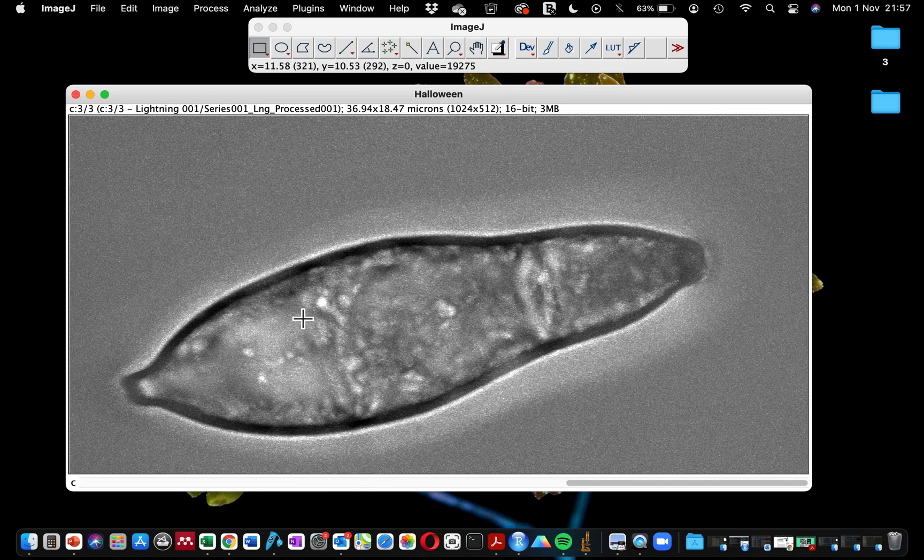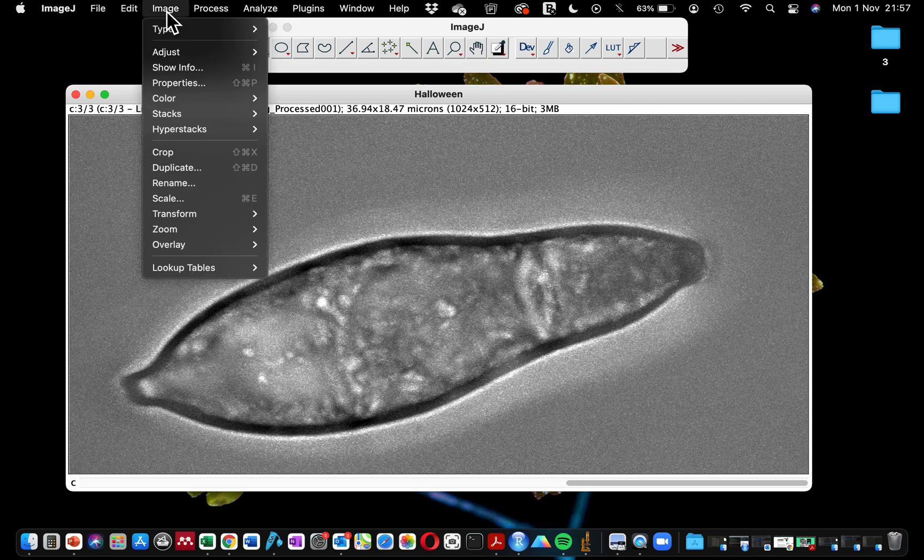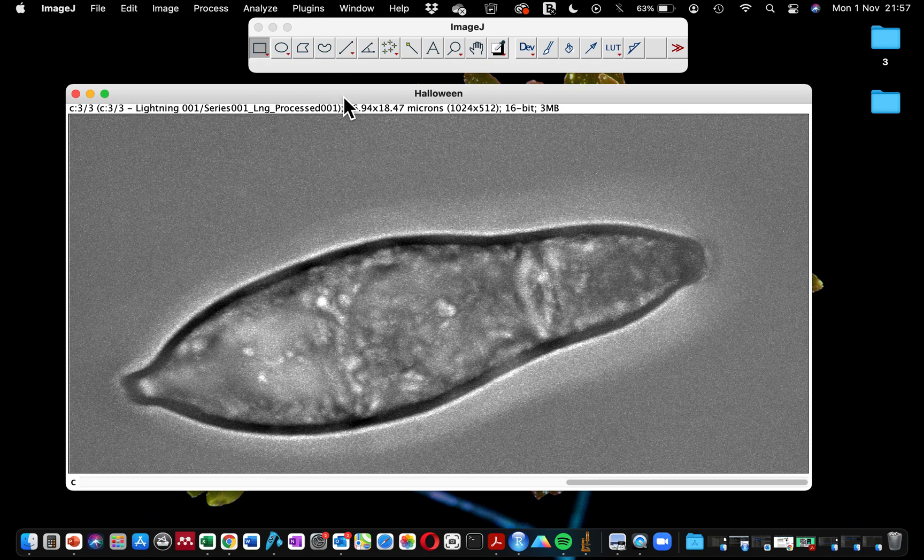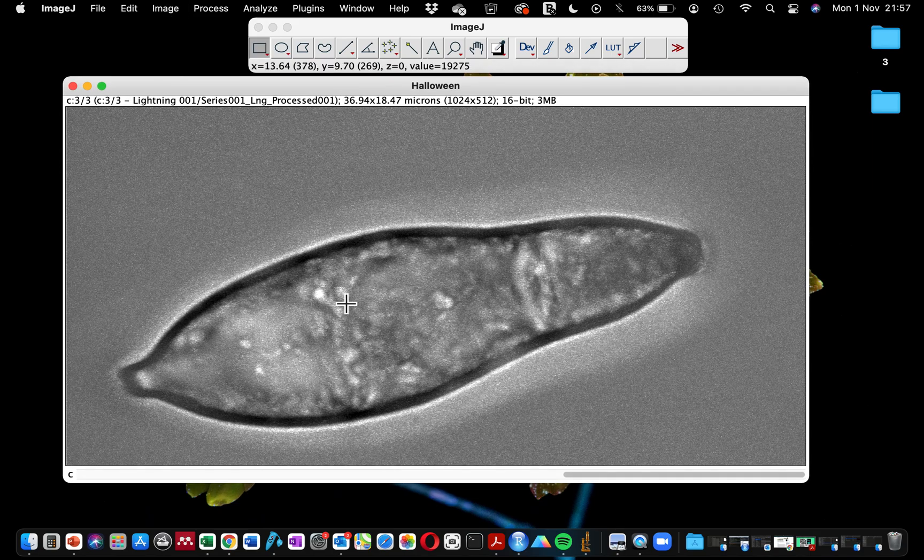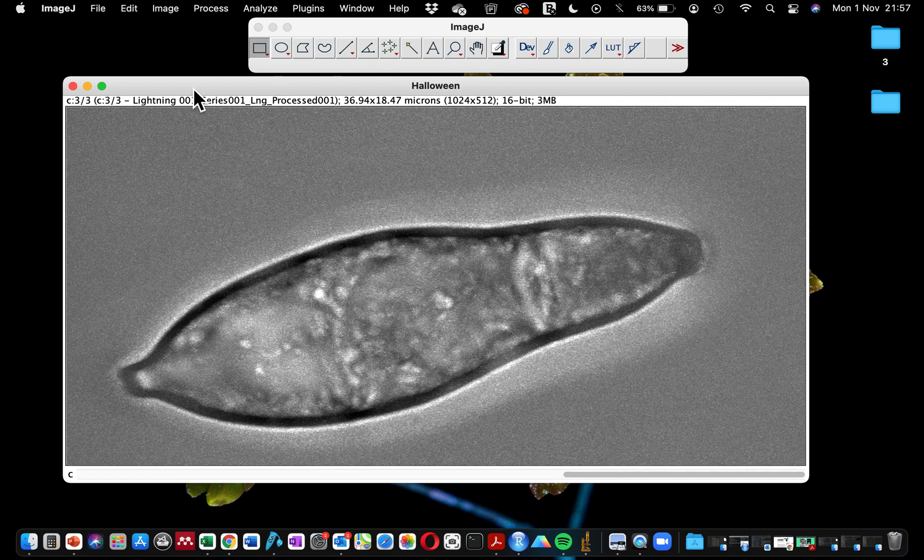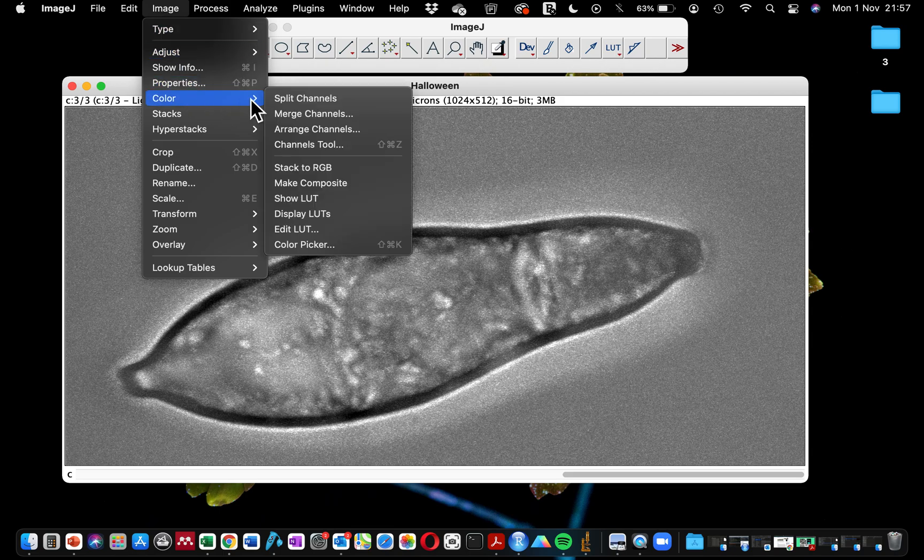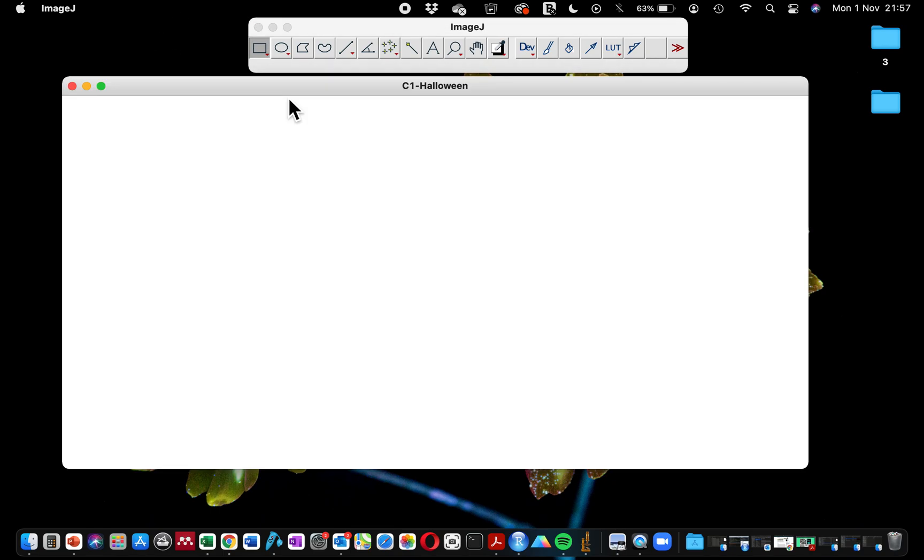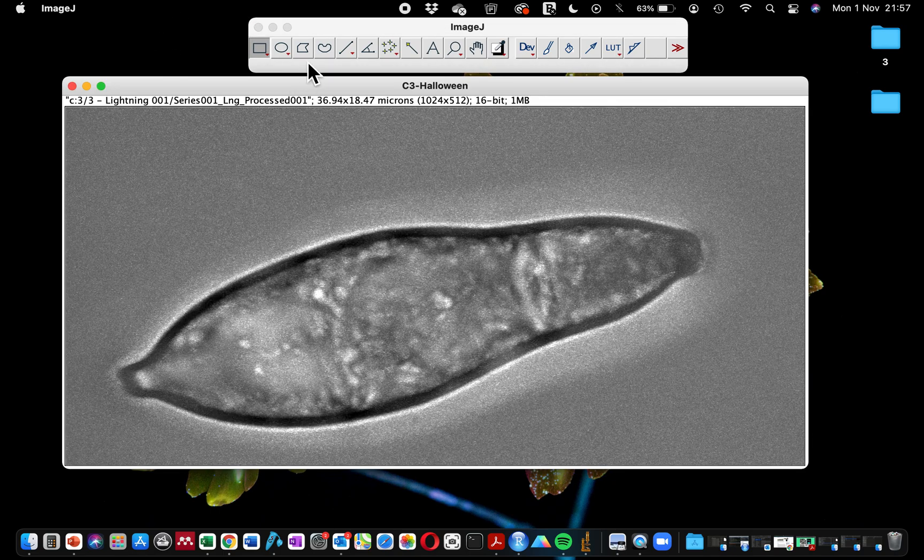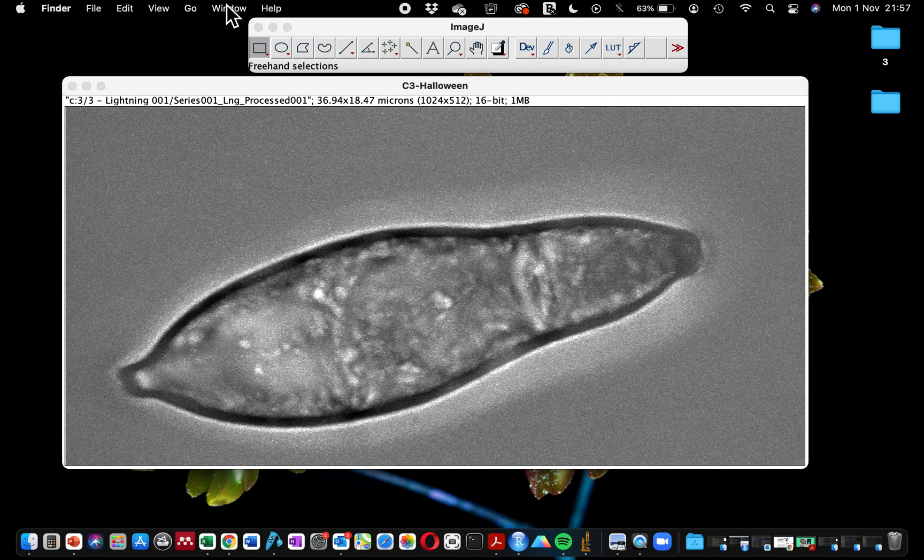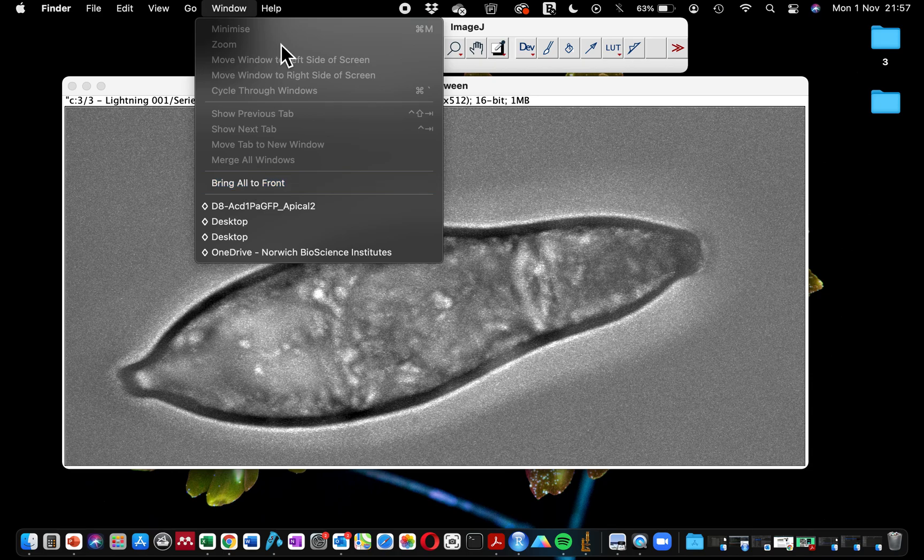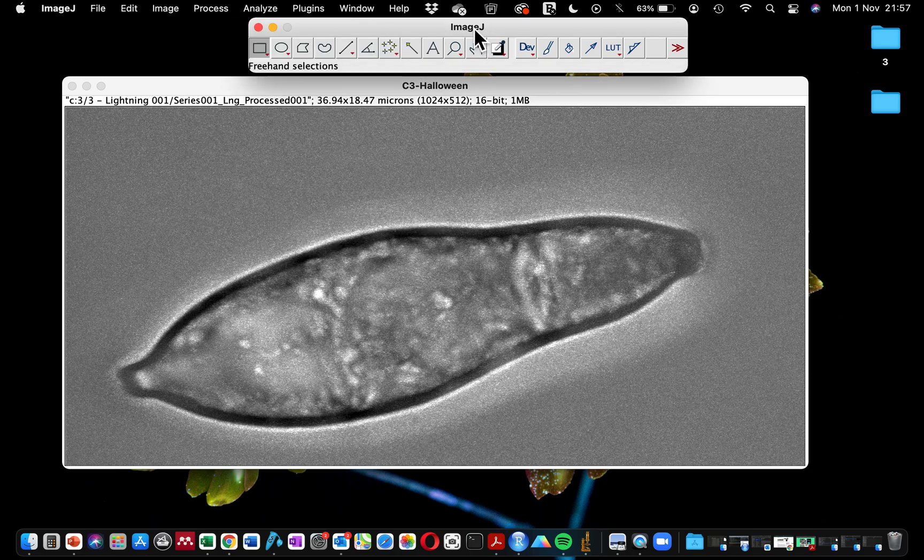What I'm going to do is first split this image, the three channels, into separate channels. To do this, I'm going to go to Image, Color, Split Channels. After splitting, what this has done is to put the three different channels as separate images.